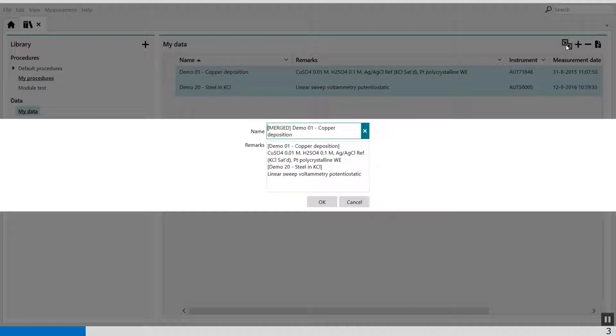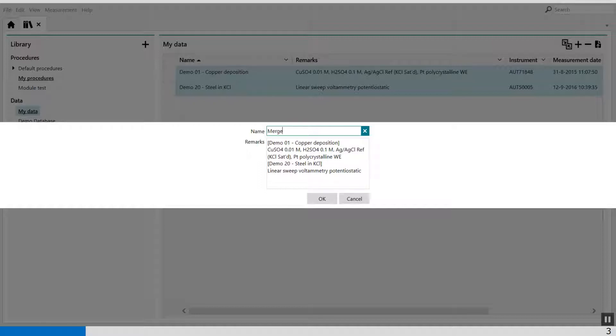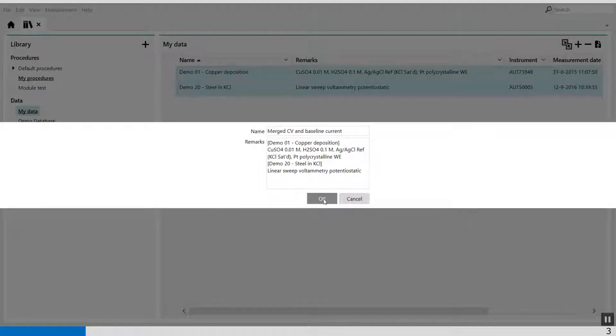When I select Merge Data, a window pops up where you can give it a name. For example, CV Merged CV and Baseline Current. Press OK.